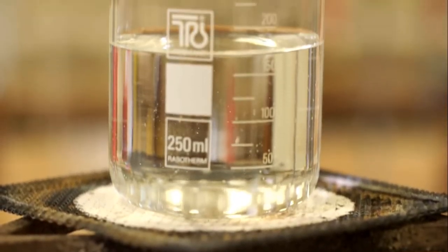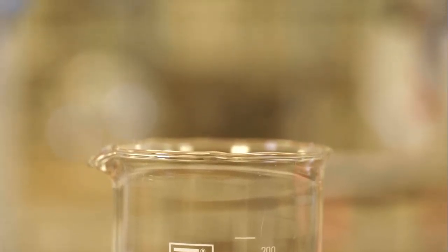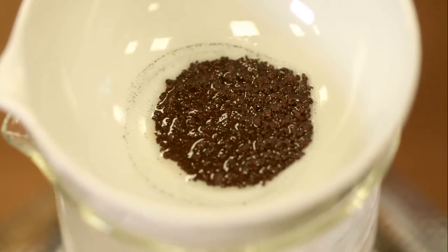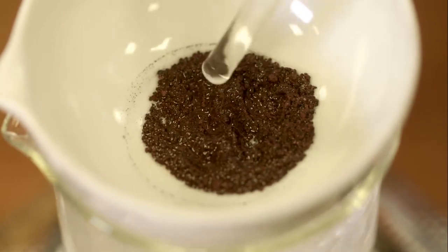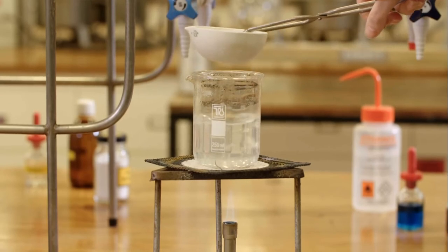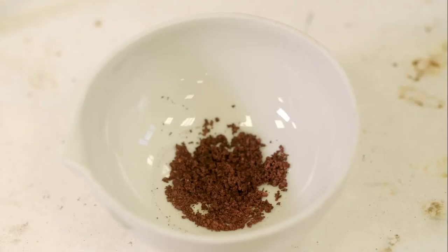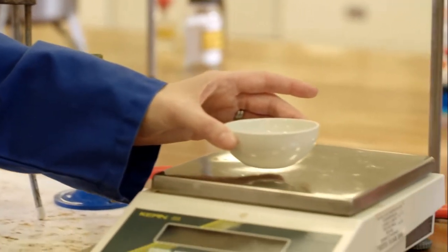Next, a hot water bath using a beaker is set up and the evaporating dish is placed on it. When the copper appears almost dry, it is stirred. When it appears completely dry, the dish is removed from the water bath and left to cool. Once cooled, the mass of the evaporating dish containing the copper is recorded.